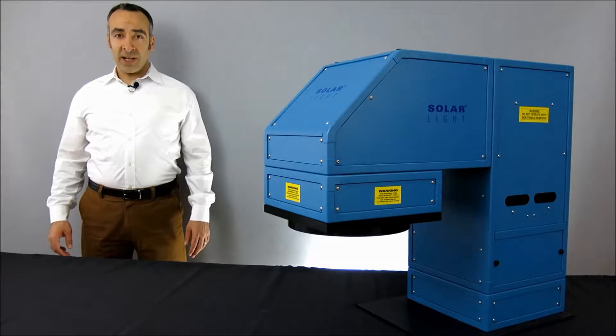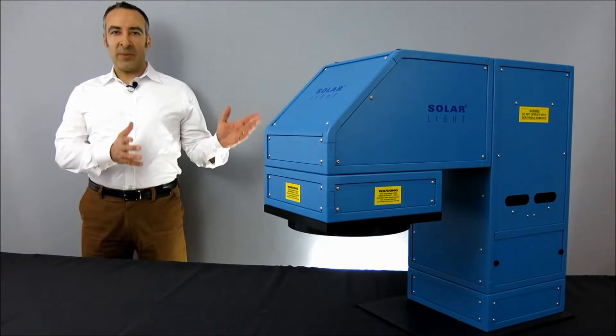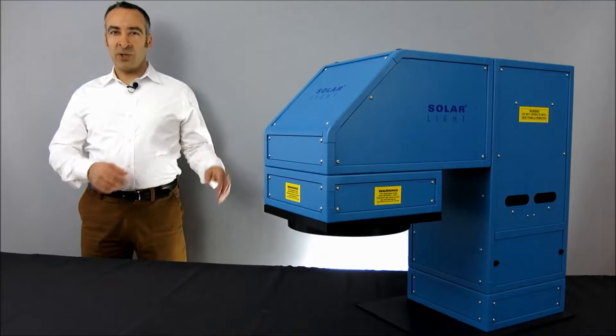Hi, I'm Moshe Levy, Vice President of Marketing at Solar Light, and today we're going to be talking about our LS1000 series solar simulators.